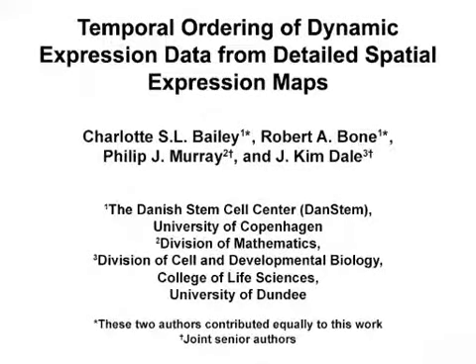The overall goal of this experimental procedure is to map the spatio-temporal gene expression dynamics of the vertebrate segmentation clock using fixed tissue sampling. This method allows an unbiased assessment of oscillatory gene dynamics in the pre-somitic mesoderm, and this is crucial to understanding the molecular mechanisms governing vertebrate somitogenesis. The main advantage of this technique is that many samples can be generated and processed simultaneously, allowing the high-throughput analysis of gene expression dynamics in fixed tissue.